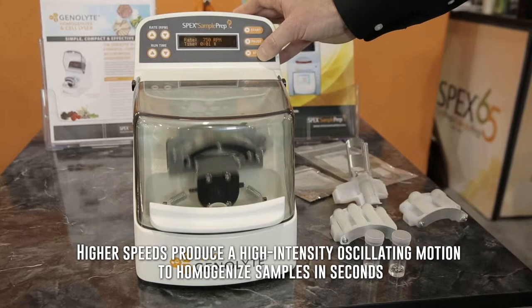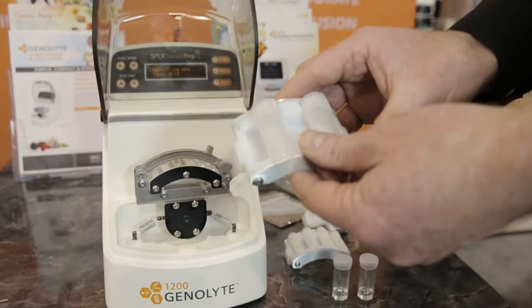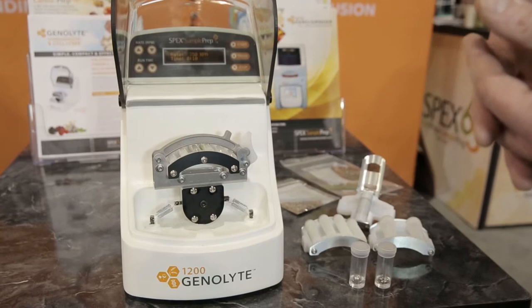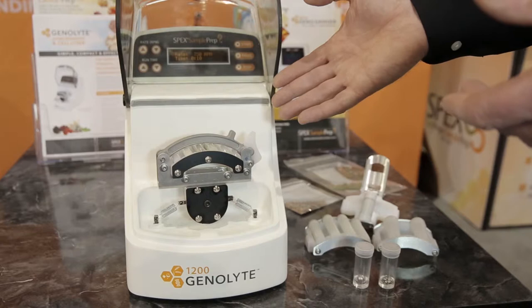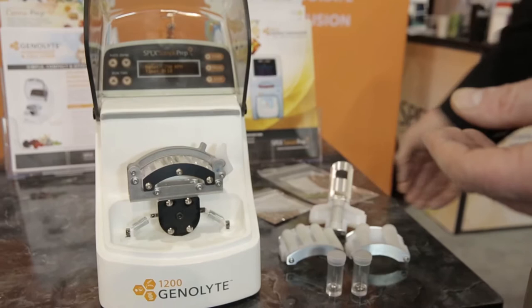We also have different sized tubes that we can load into the same clamp — 5 ml tubes and 7 ml tubes. We also have a tungsten carbide liner that we can use to grind very hard substances like rocks and minerals. This is a very versatile mill in terms of sample types. For plants or animal tissues, people are looking at DNA or RNA, while for rocks and minerals, people might be interested in elemental content, making this product useful across a diverse range of labs and analytical techniques.